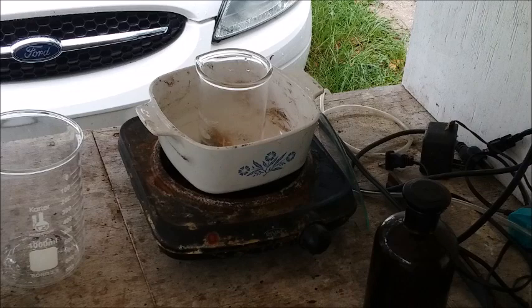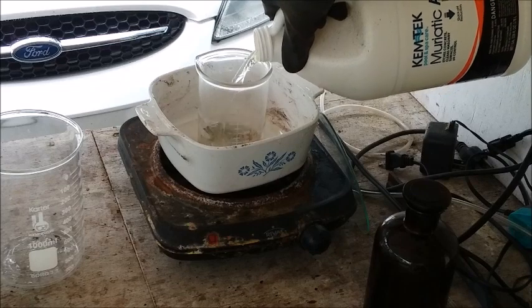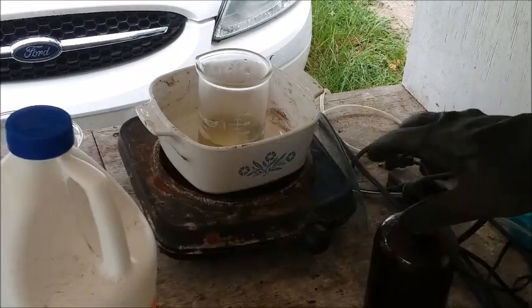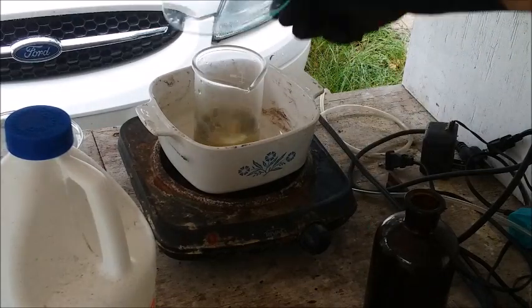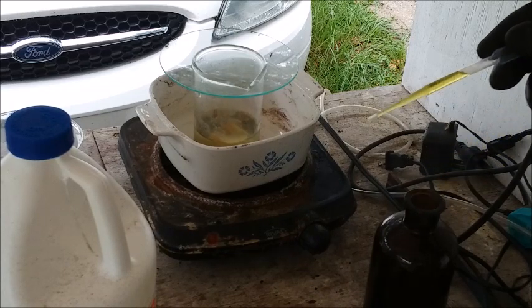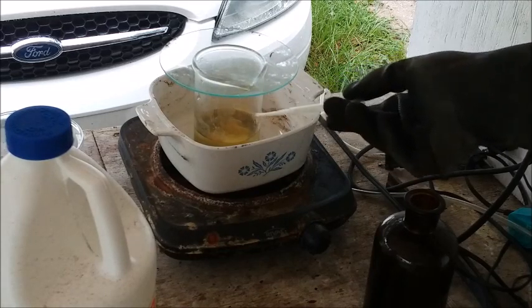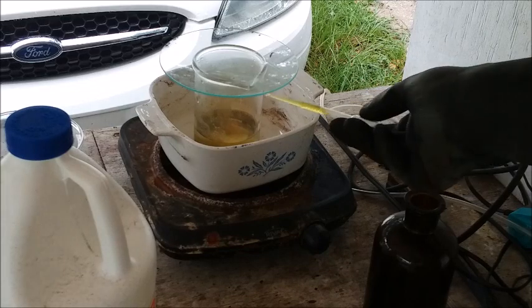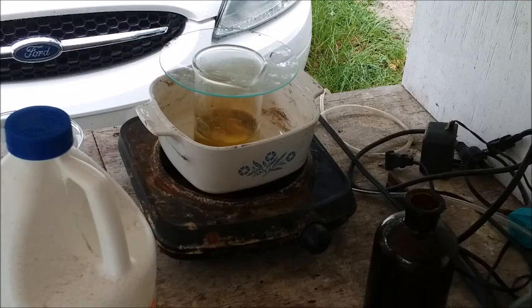So I've got some muriatic acid here, hydrochloric acid, however you want to call it. I'm going to put not quite 150 milliliters in there. All right. And now for a couple of pipettes of nitric acid. So that's about 1.5 milliliters of nitric acid right there. There's about another 1.5 milliliters going in. Okay. We'll see how that does.